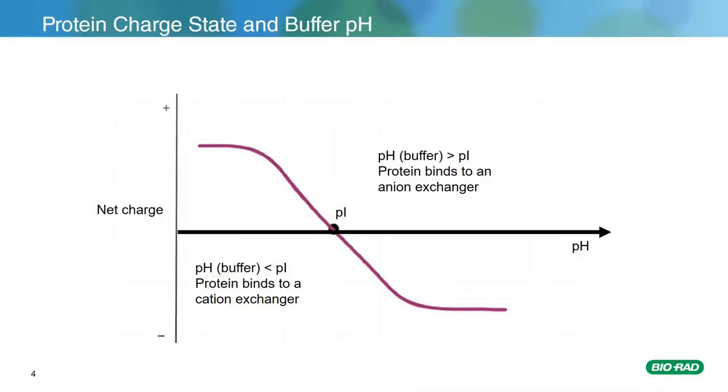This is a diagram that we often see in textbooks teaching ion exchange chromatography. To come up with a purification strategy, we have to estimate the isoelectric point of the target protein first, either experimentally or by calculation from its encoding DNA sequence. When the purification is performed at a buffer pH higher than the pI, the target protein will be negatively charged, and it will be bound by an anion exchanger. We can also choose a cation exchanger if we prefer to run separation at a pH more acidic than the pI.